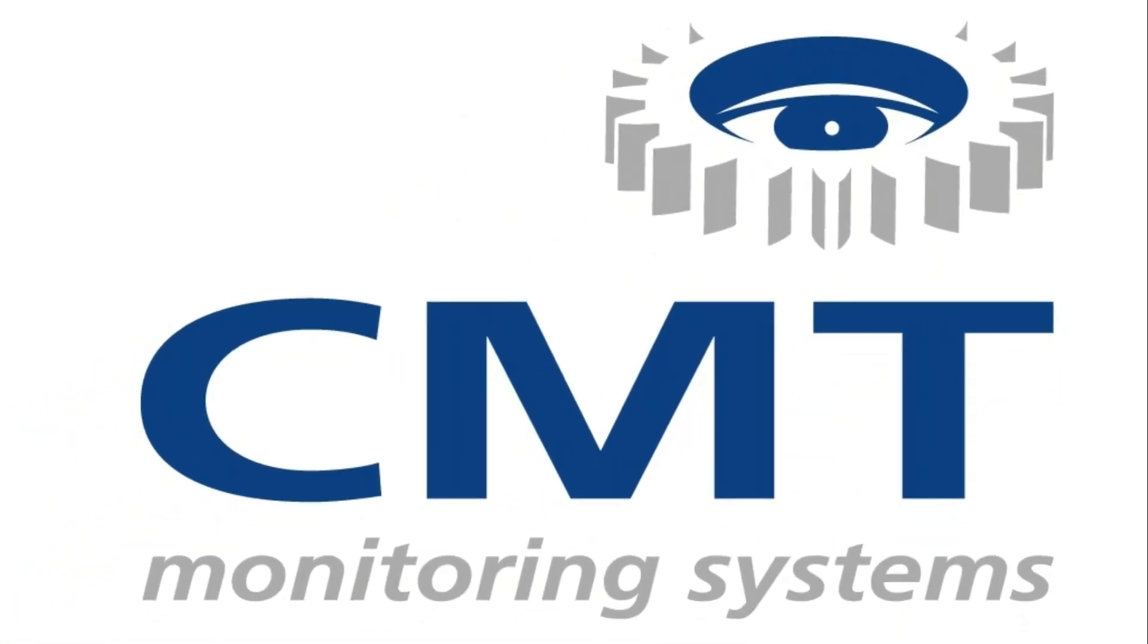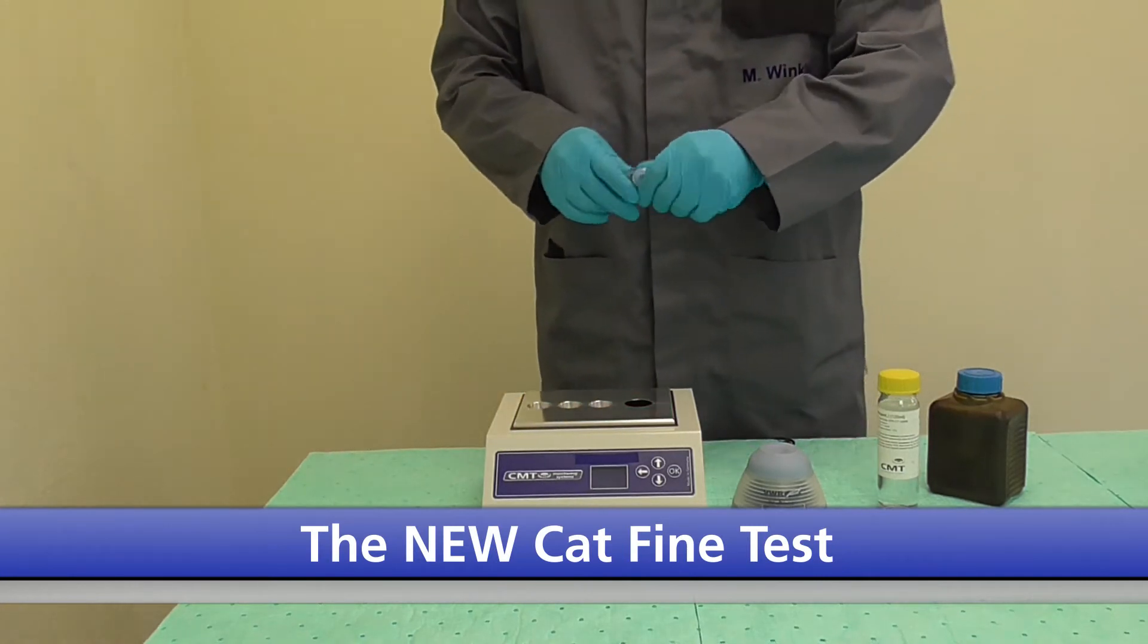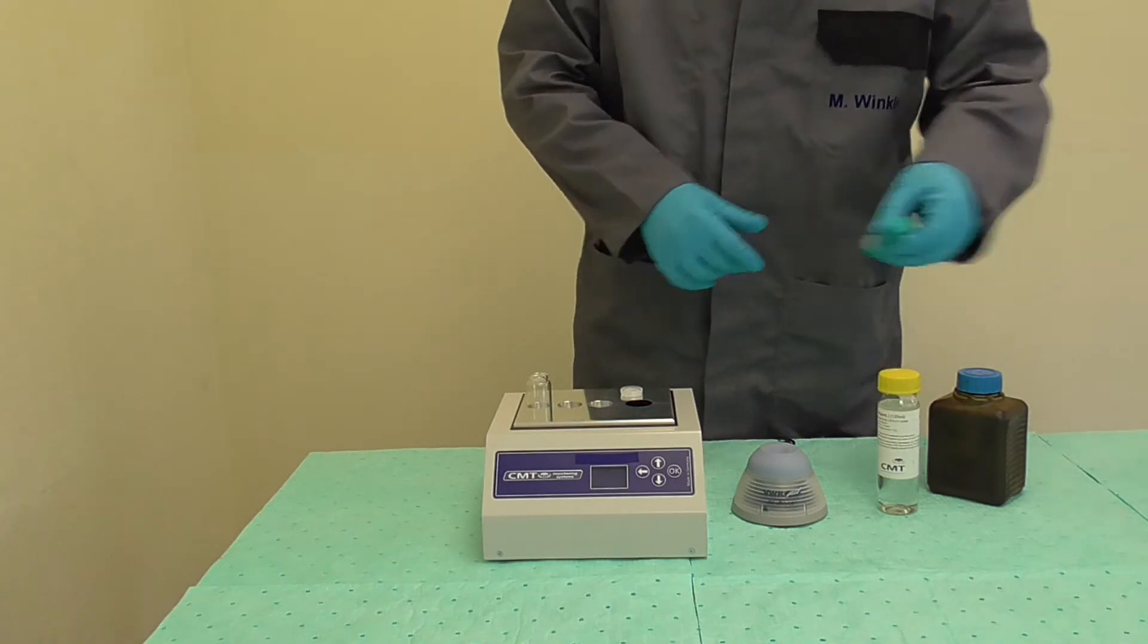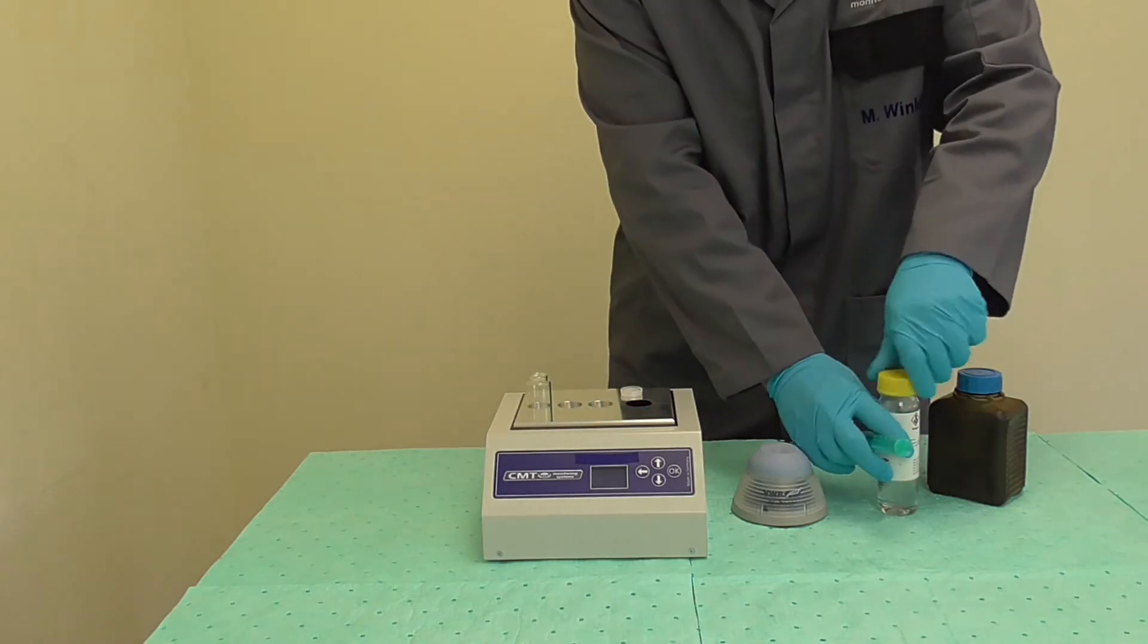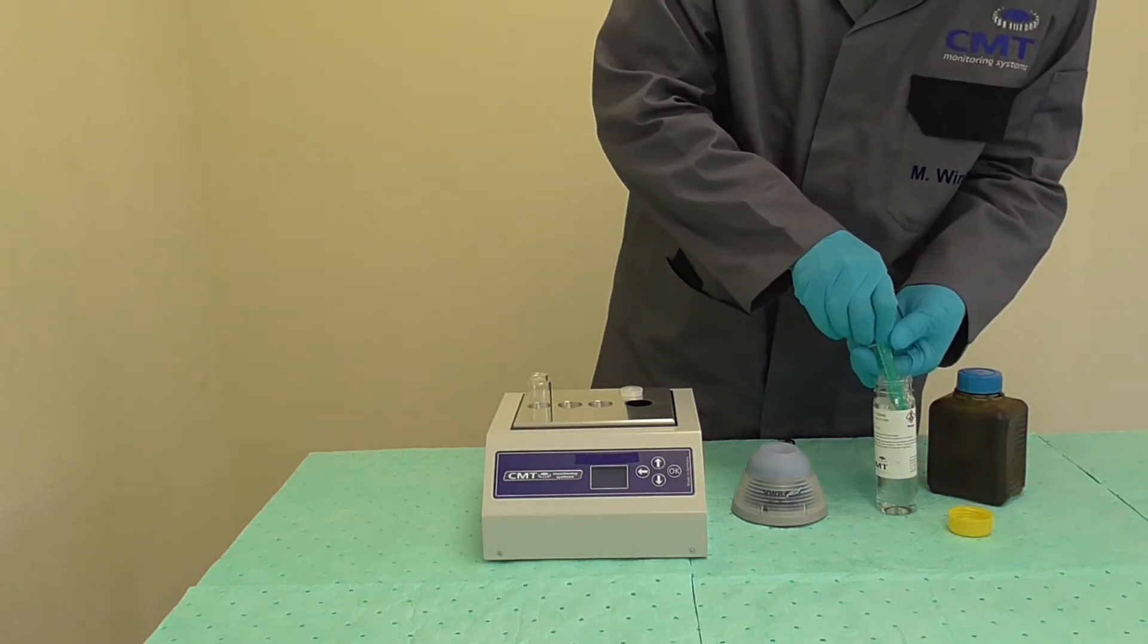This video will explain how to use the new CMT cat fine tester. Take a new clean vial, uncap it, and place it on top of the device in one of the vial holders. Add 9 milliliters of reagent J to the vial using the 10 milliliter syringe provided. You can reuse this syringe in later tests.